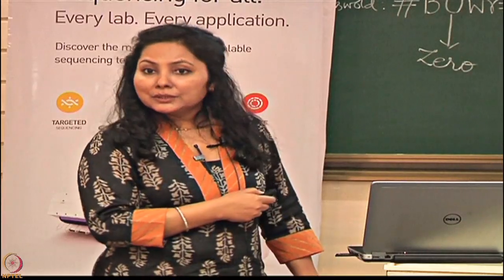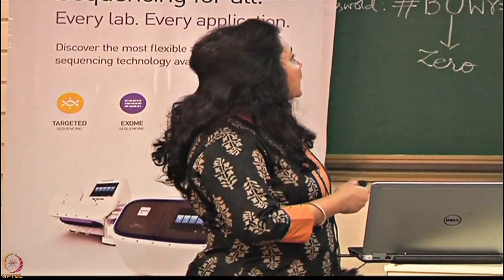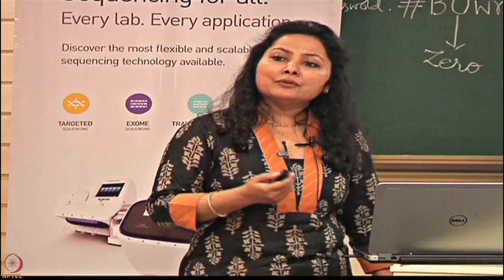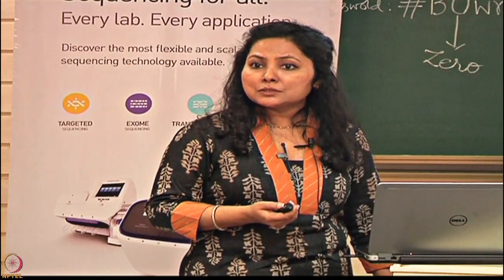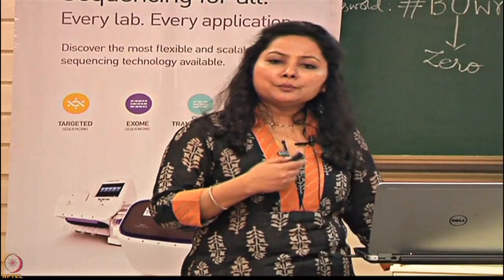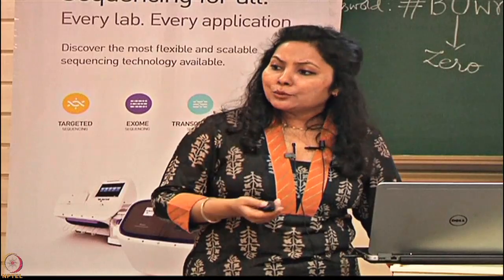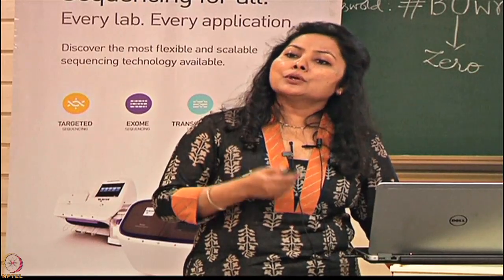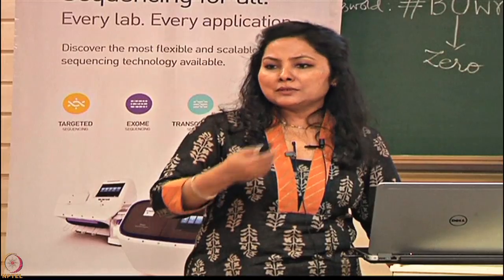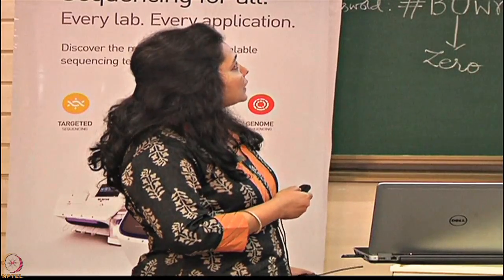Till date, this has been the gold standard technology for doing a lot of things like targeted sequencing. So you have certain amplicons to be sequenced, or you have a de novo organism to be sequenced to fill up those kinds of assemblies. Then there are multiple fragment analysis applications wherein you are not actually sequencing the fragment, you are just looking into the size, and based on the size polymorphisms, you are giving certain scientific answers. So this is about the capillary sequencer.